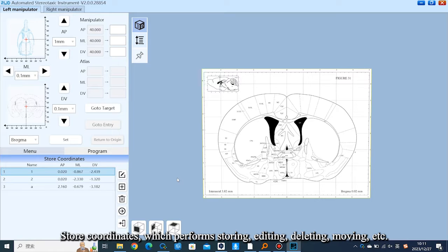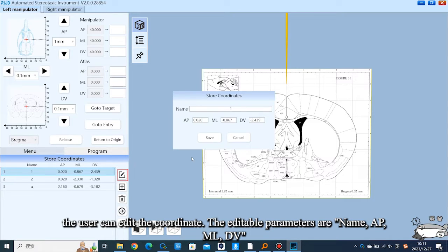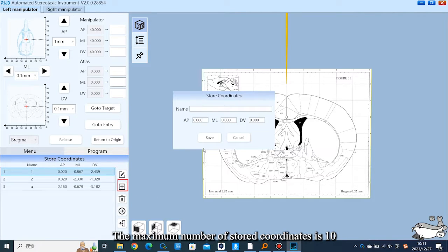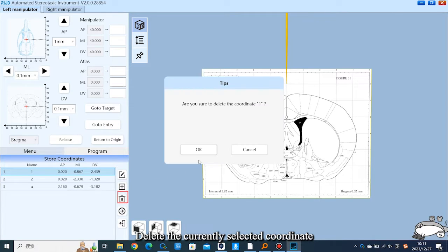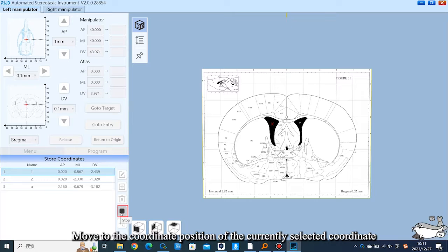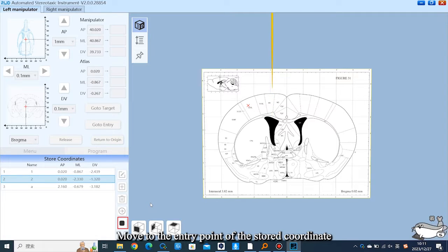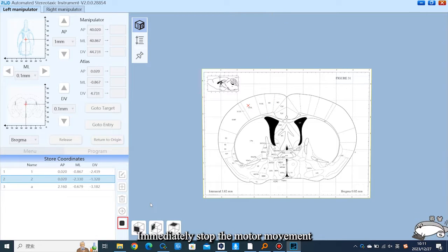The Store Coordinates function allows storing, editing, deleting, and moving coordinates. The user can edit the coordinate; editable parameters are name, AP, ML, and DV. The maximum number of stored coordinates is 10. You can delete the currently selected coordinate, move to the coordinate position of the currently selected coordinate, move to the entry point of the stored coordinate, or immediately stop motor movement.